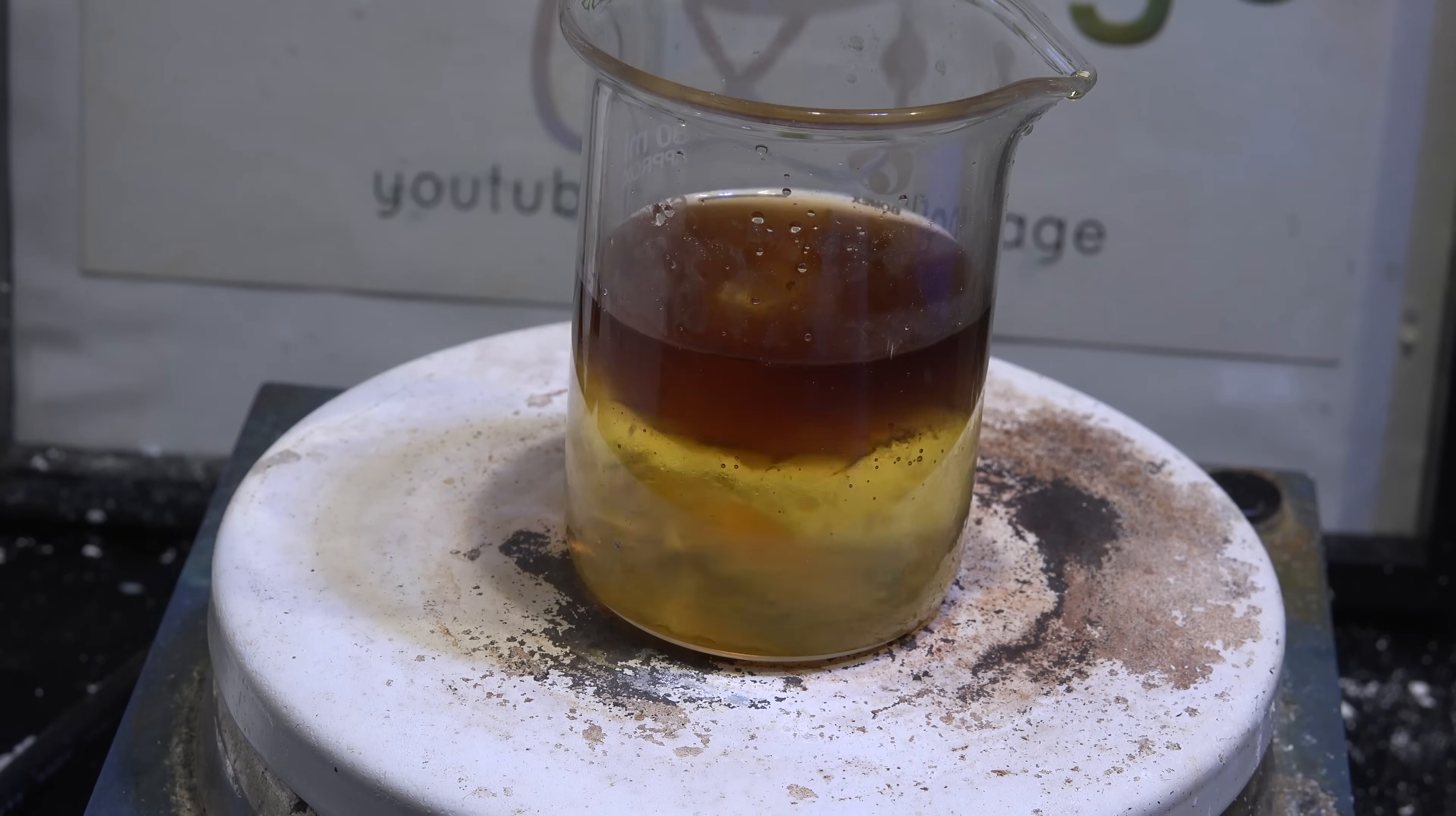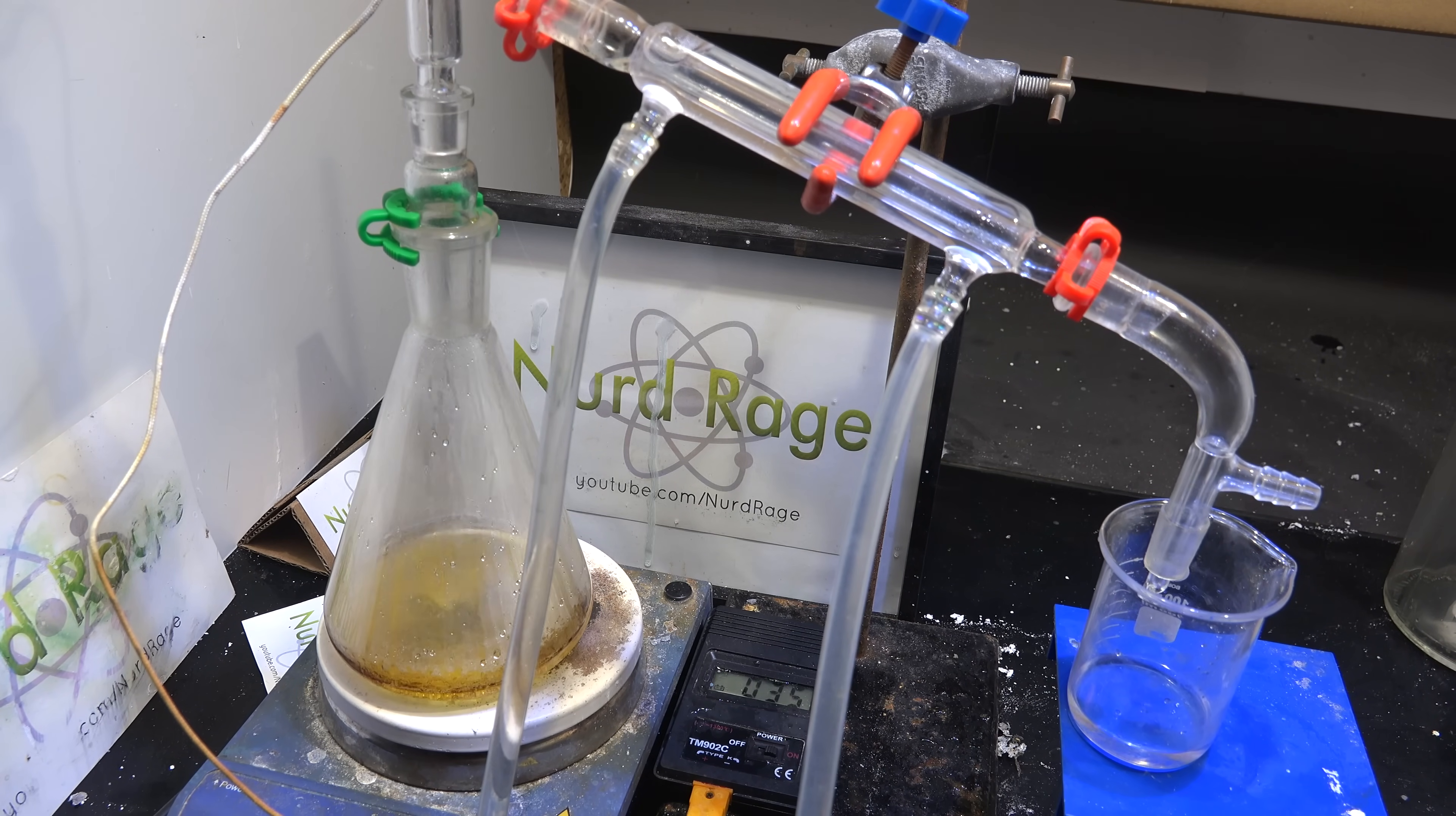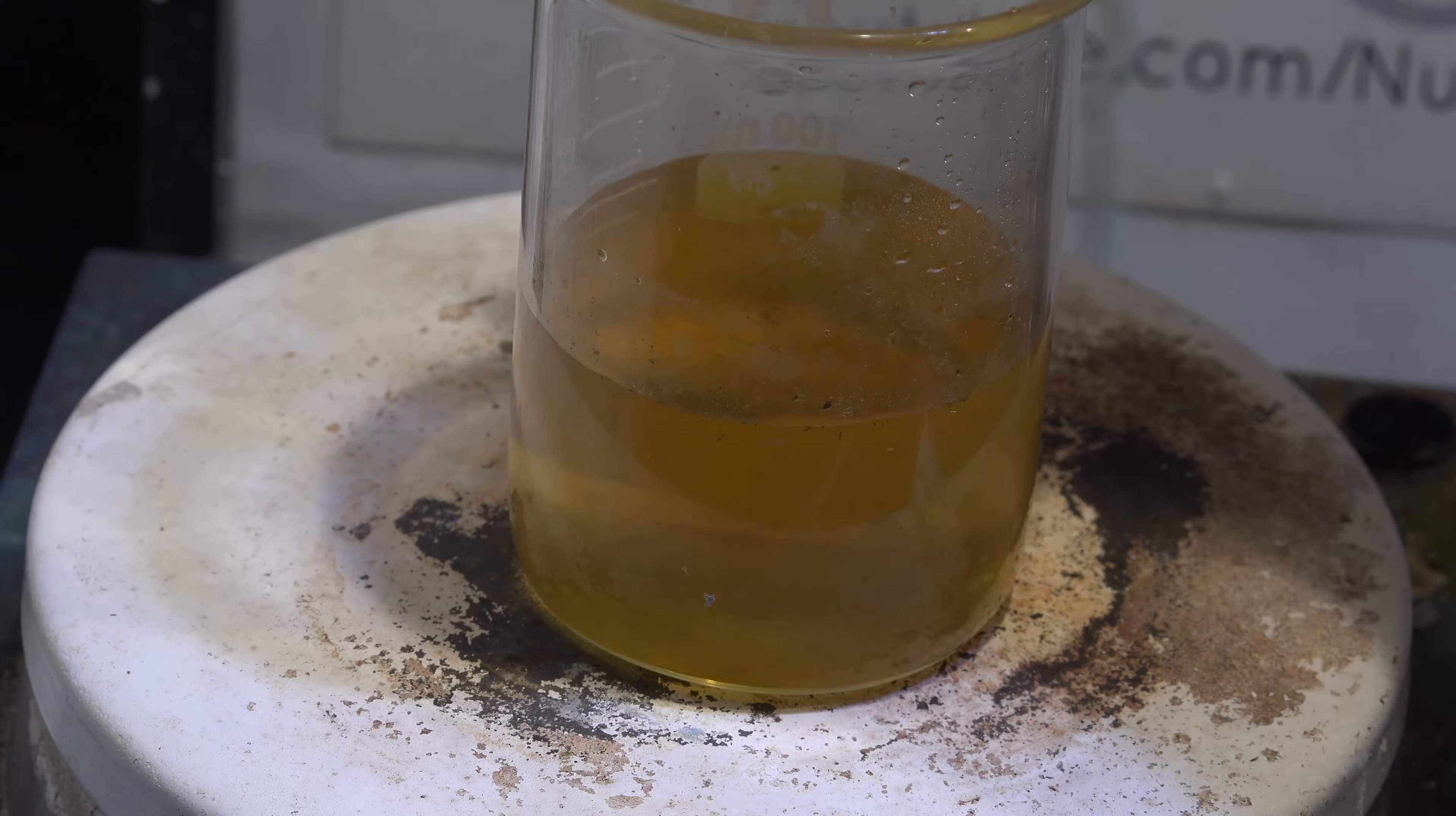The separation of layers shows that the ether hasn't fully distilled off. Just put it back into distillation and distill off the ether until water starts distilling. The ether now distills off easily because the gallium chloride can bind with water instead of ether. Now at this point we have a solution of gallium chloride and water.